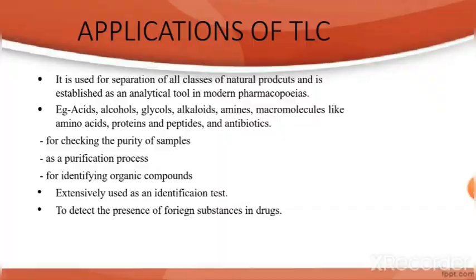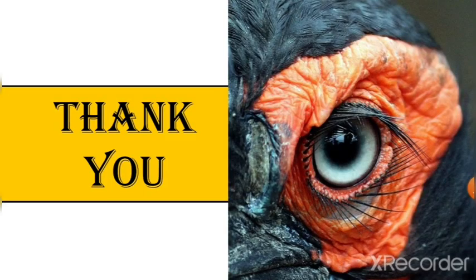So this is all about the definition of TLC, types of TLC, how we can perform it in the lab, that is the protocol for TLC, and how we can do the observation and result analysis in the lab for the identification of compounds.